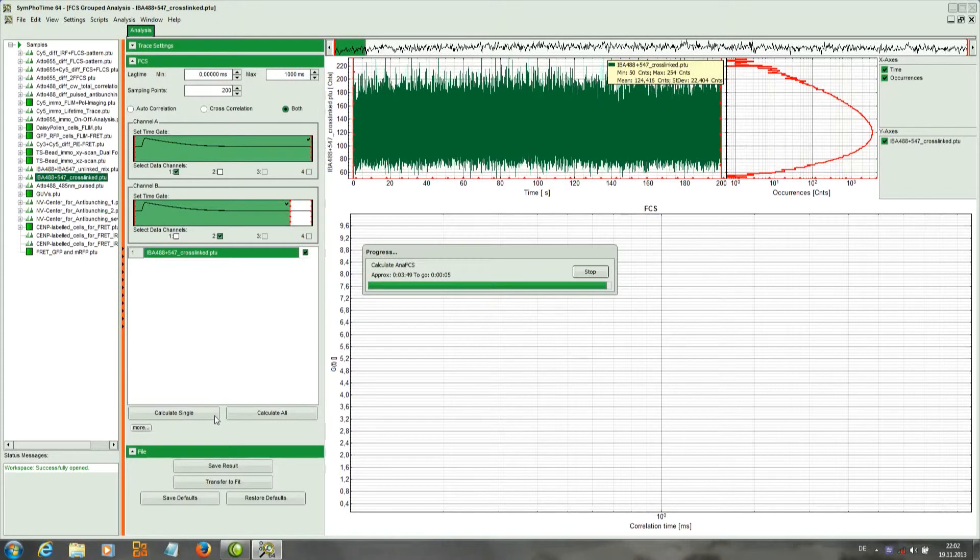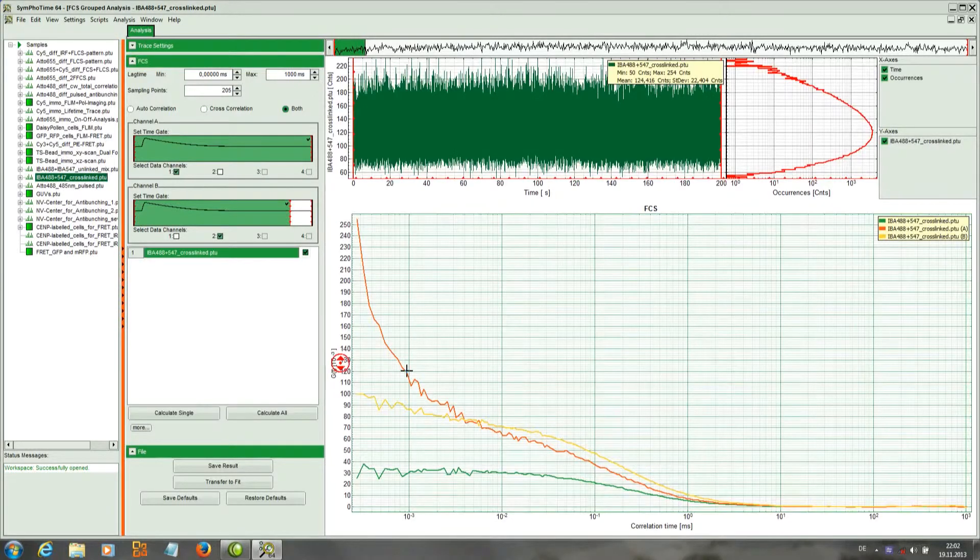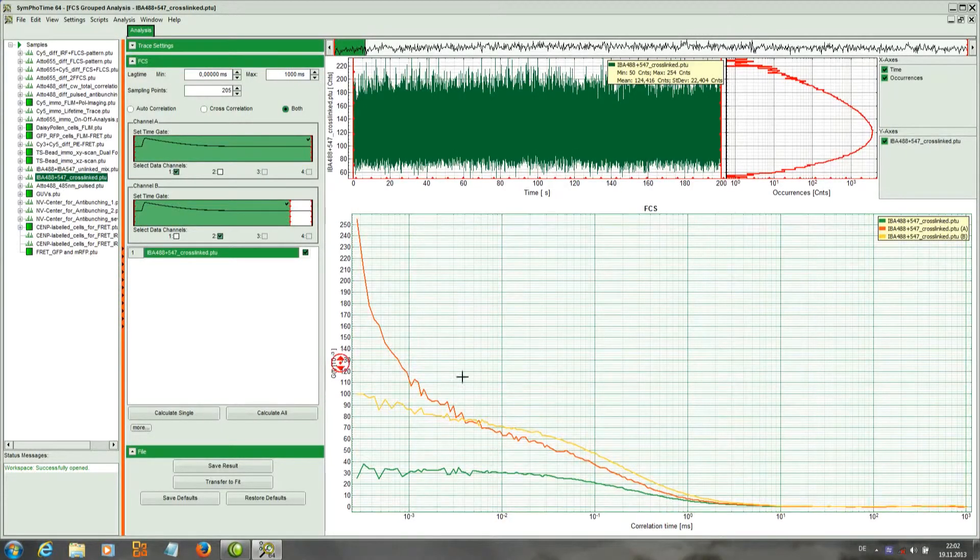Once the calculation has finished, we will see the cross correlations and the autocorrelations appear here.